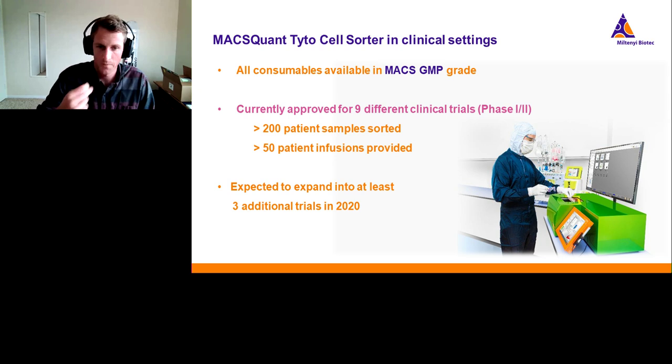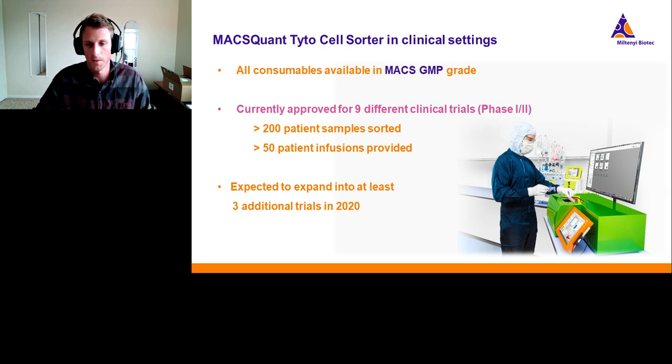And in this context, we're integrating into a system where samples are usually pulled from a patient, with some sort of viral transduction or enrichment. Some sort of culturing occurs where we're either giving extra power to the immune system or culturing up the immune system so that it's more present in the tumor environment, and then going back into patients.